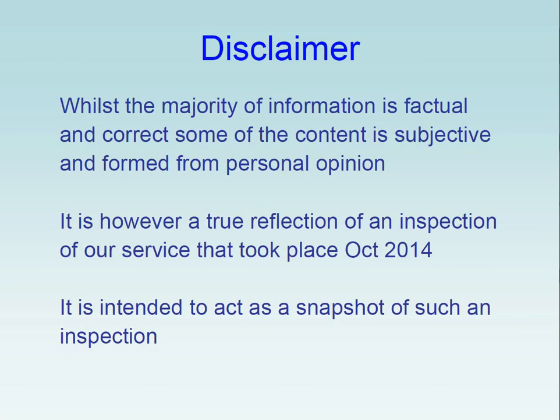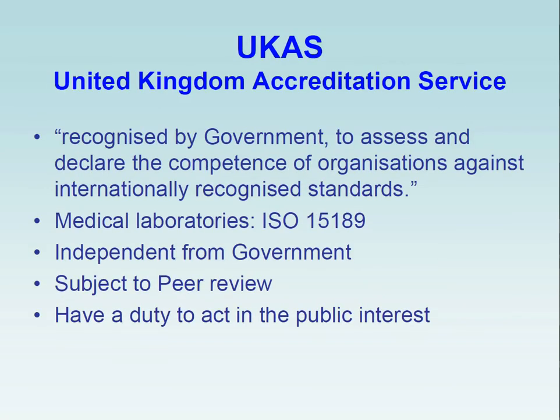However, it is intended to act as a snapshot of such an inspection, and it may be what you might expect to see if you would have one. So UKAS, the United Kingdom Accreditation Service, is recognised by government, and it's there to assess and declare the competence of organisations against internationally recognised standards. And of course those standards are ISO 15189 if you live in the north, or ISO 15189 as we tend to use in the south.